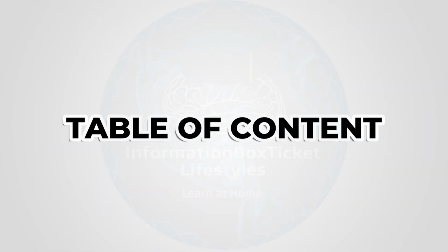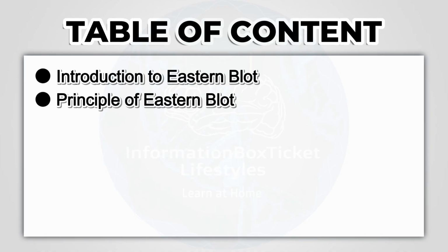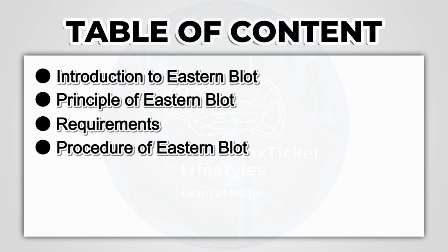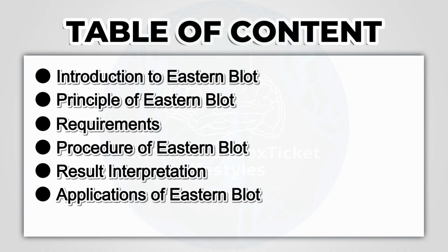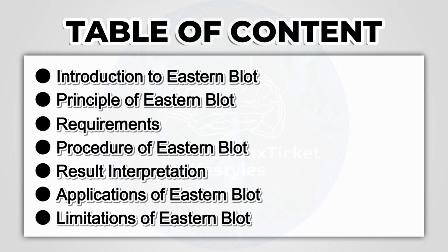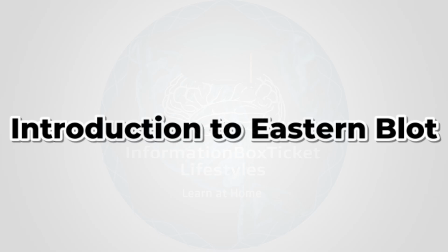Table of Contents. Introduction to Eastern Blot. Principle of Eastern Blot. Requirements. Procedure of Eastern Blot. Result interpretation. Applications of Eastern Blot. Limitations of Eastern Blot. Introduction to Eastern Blot.